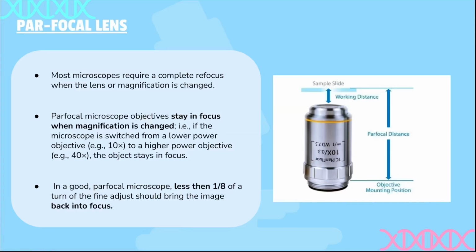So for example, when a person is viewing a specimen under a high magnification, the person can then change to a lower magnification and the specimen should still be in focus without the person having to manually adjust the focus. Therefore, parfocal microscopes are easier for beginners to use.